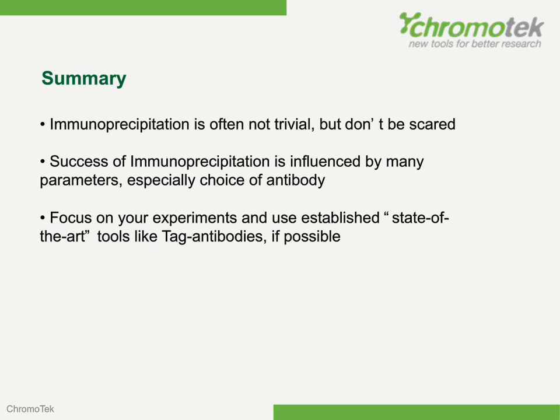So in summary, we showed you that immunoprecipitation is often not trivial, but don't be scared. It will work if you use the right tools. And the success of the immunoprecipitation is influenced by many parameters, and as already mentioned many times, especially the choice of the antibody. And to focus on your experiments, you might use established state-of-the-art tools like tag antibodies if it's possible.